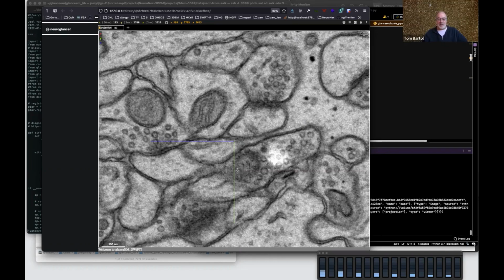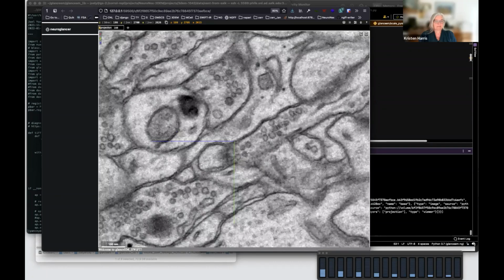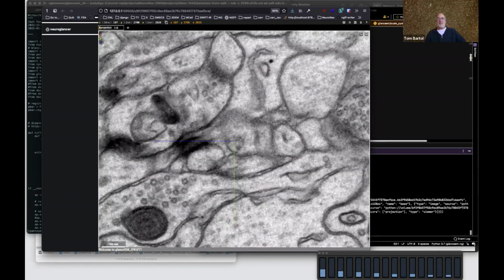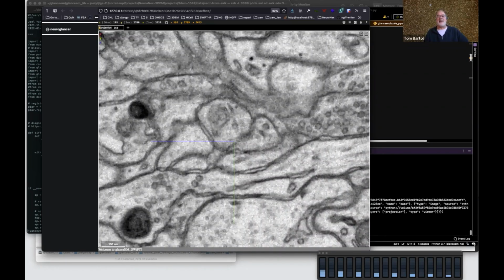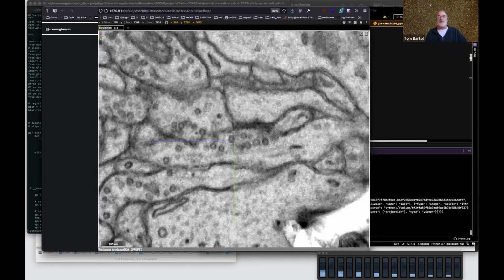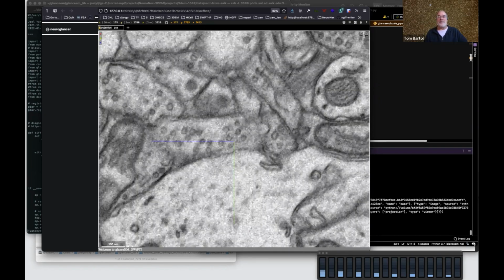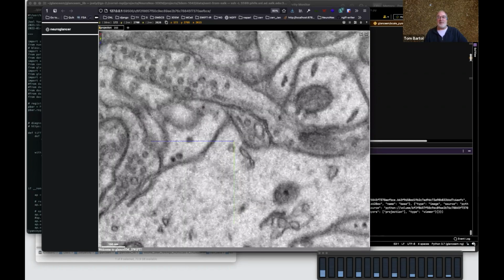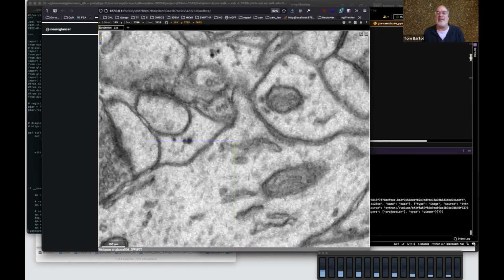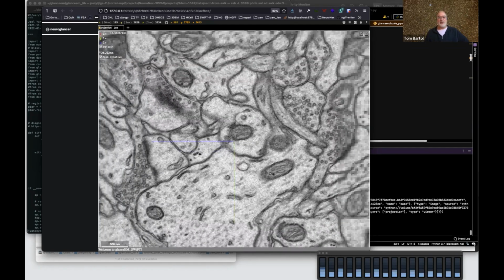Yeah. So use the dot and comma on the keyboard and go one step at a time. I see. That's better. But it's not super aligned. It doesn't really let it shift. Yeah, this is aligned the wrong way. It's done with alignEM-SWiFT, but it's done using the wrong method that we still have to improve on in the actual code that we're using, right? I see. That's what remains to be done.